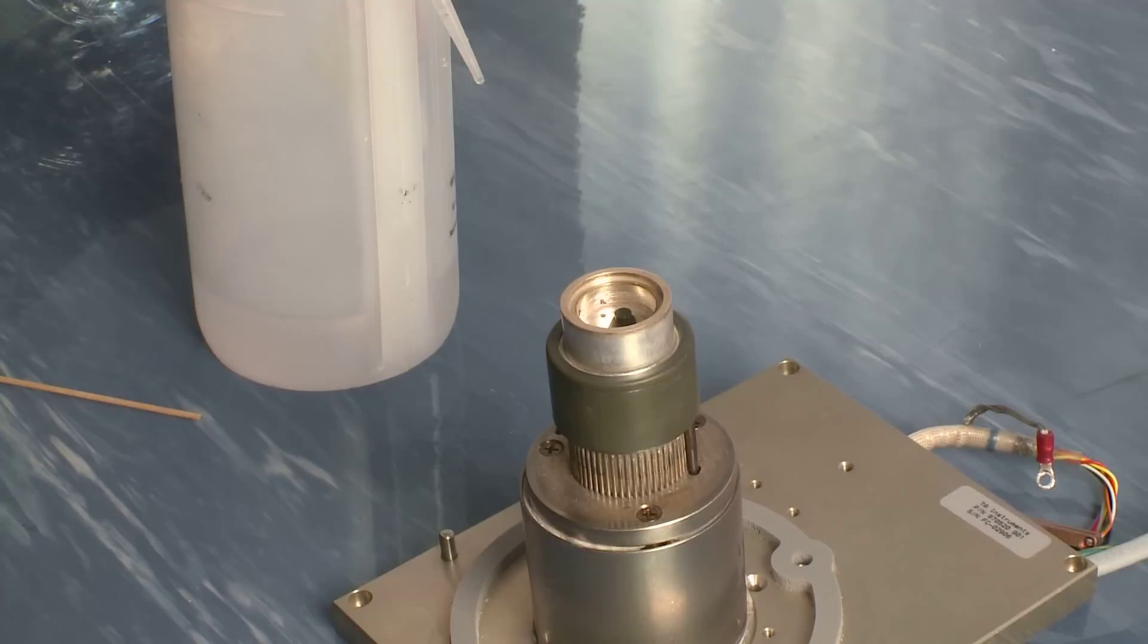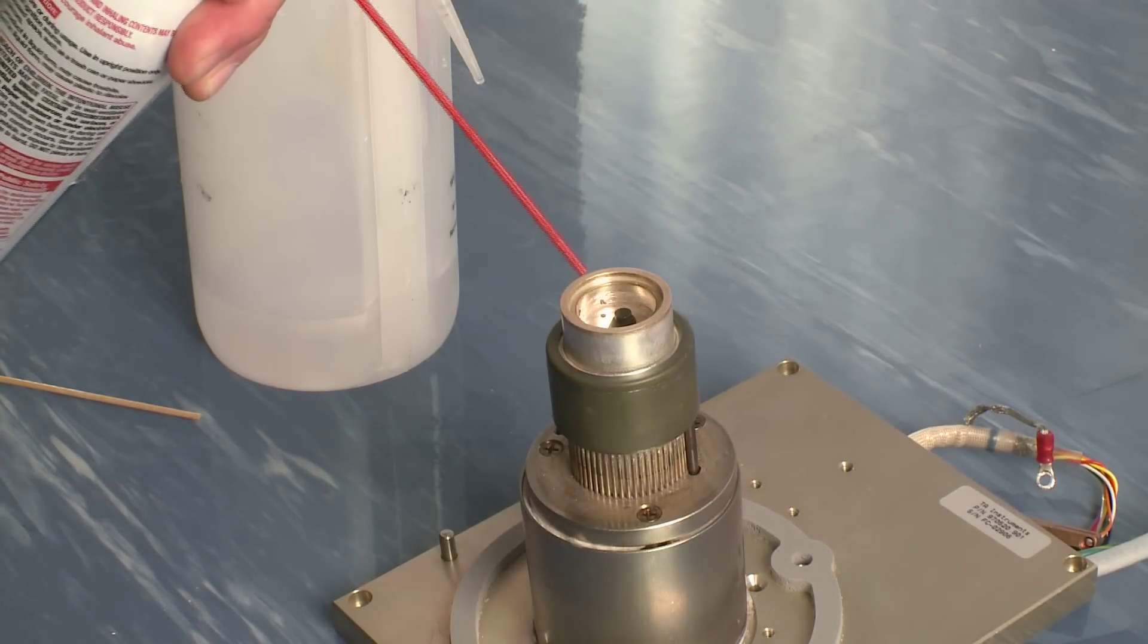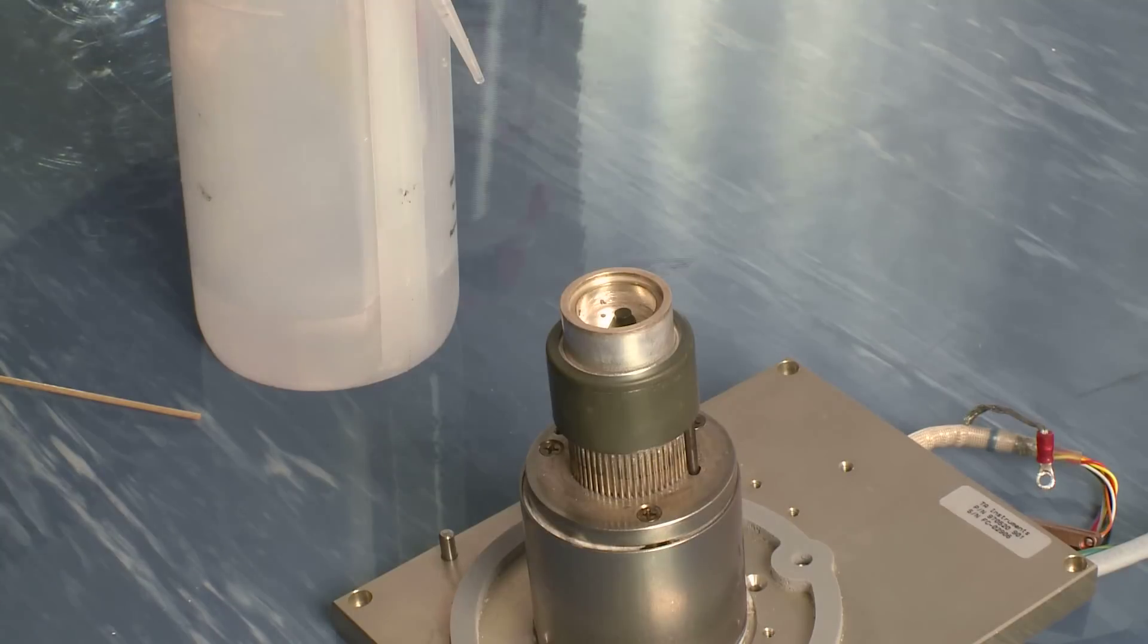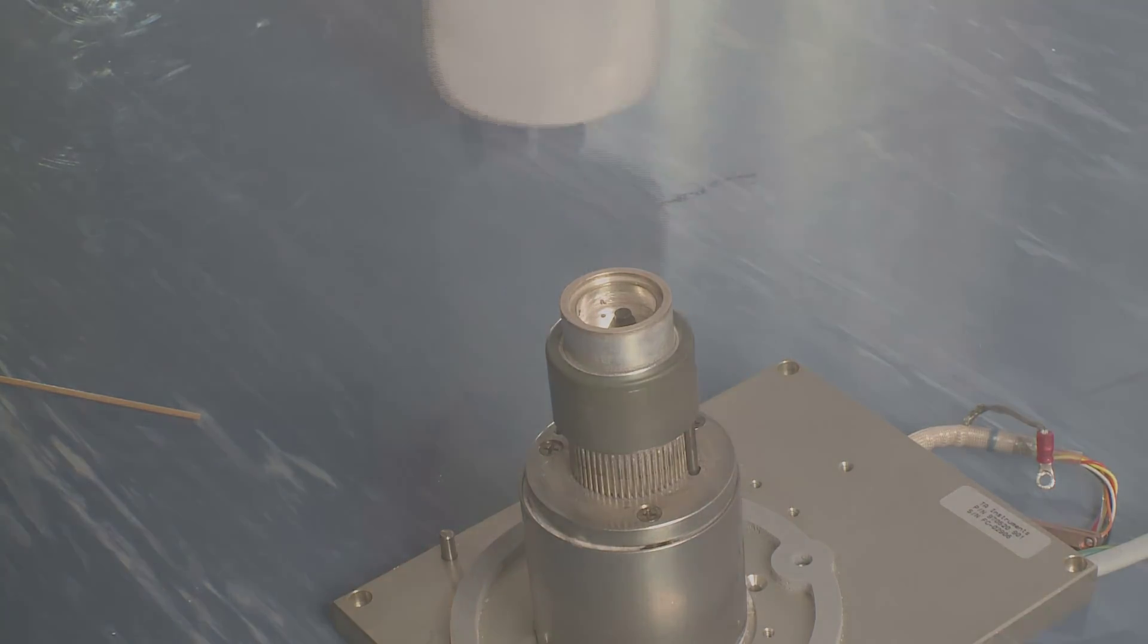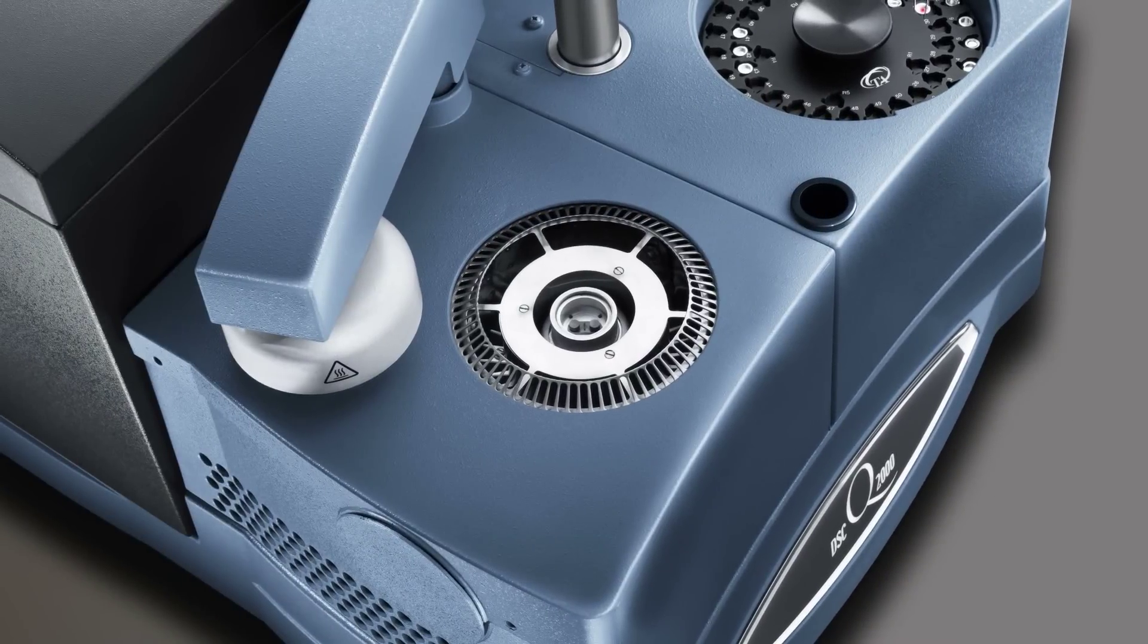Again, spray compressed air in case you got some cotton fibers in there. Then we suggest heating the cell up to about 100 degrees for maybe 10 minutes to evaporate any residual solvent.